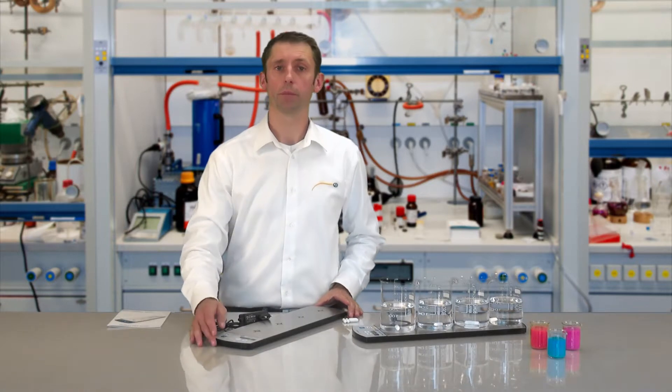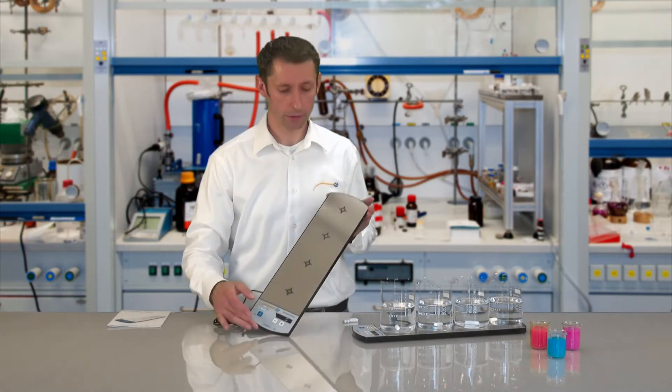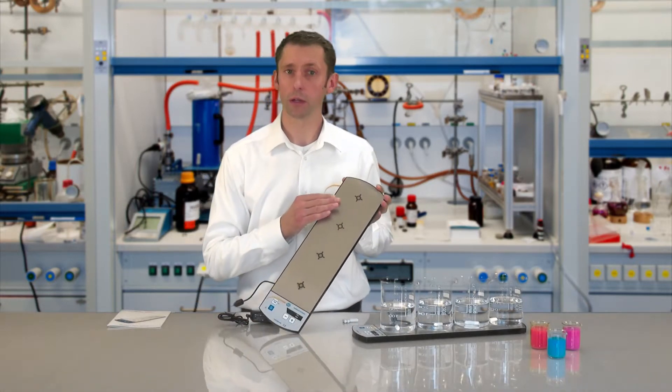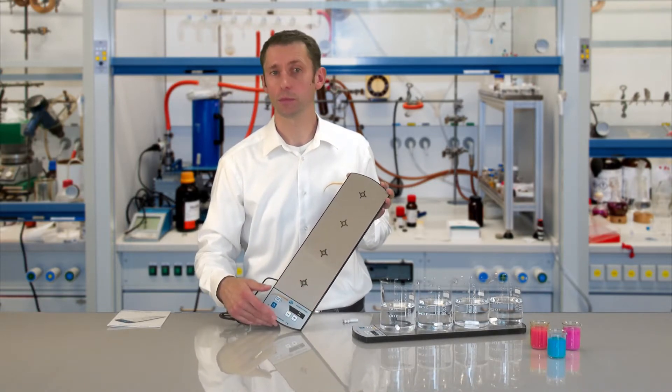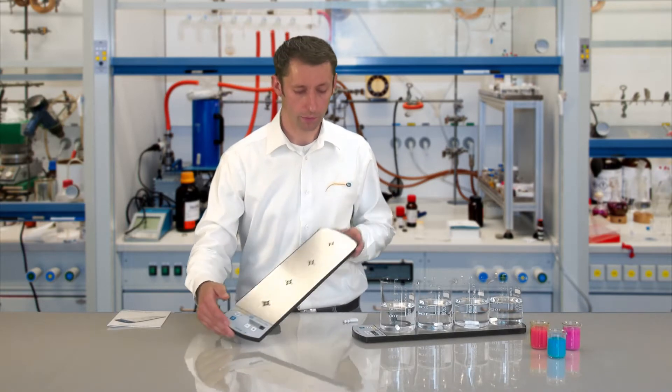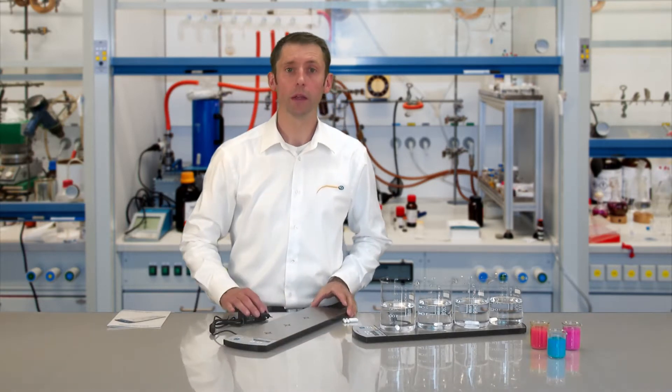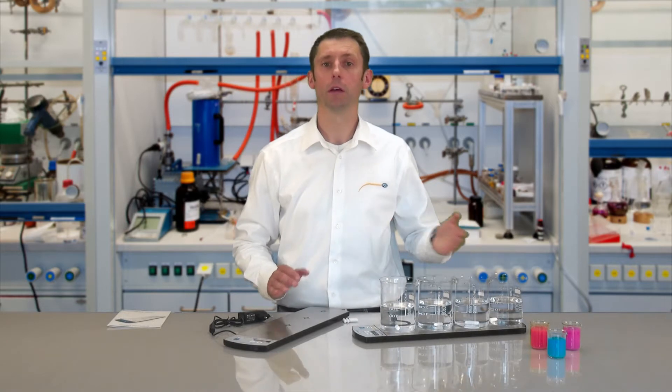I'll summarize briefly. The Magnet Stirrer PC-MSR400 is a magnet stirrer with four stirring surfaces for containers with a diameter of around 94 mm. The stirring volume is per measuring jug around 400 milliliters.